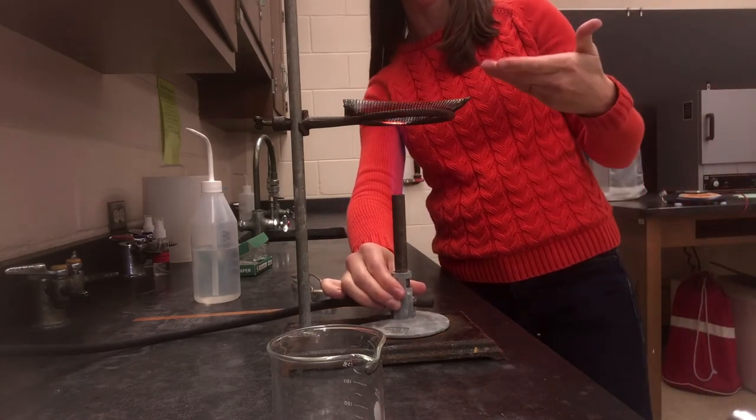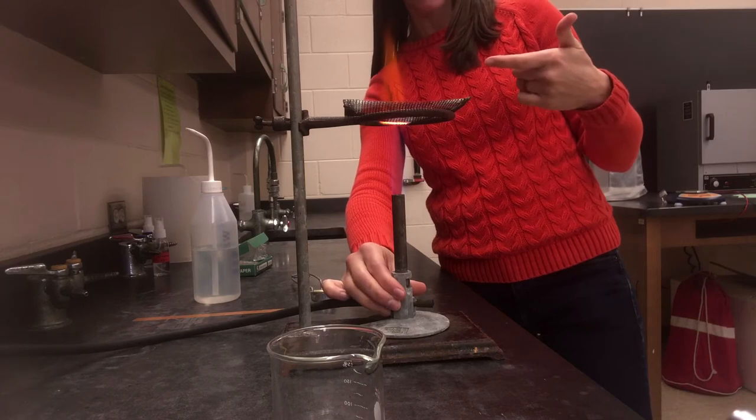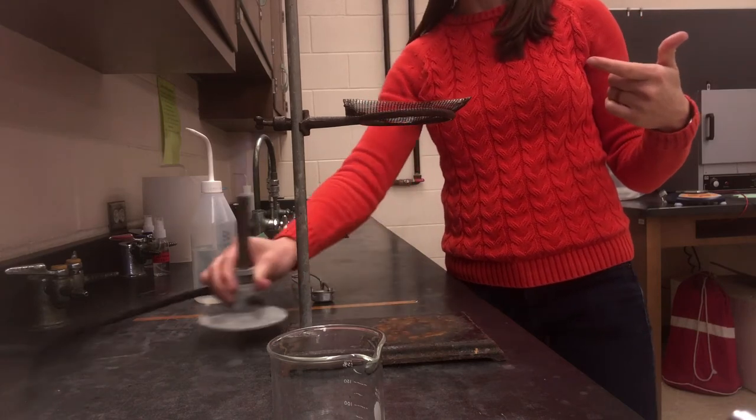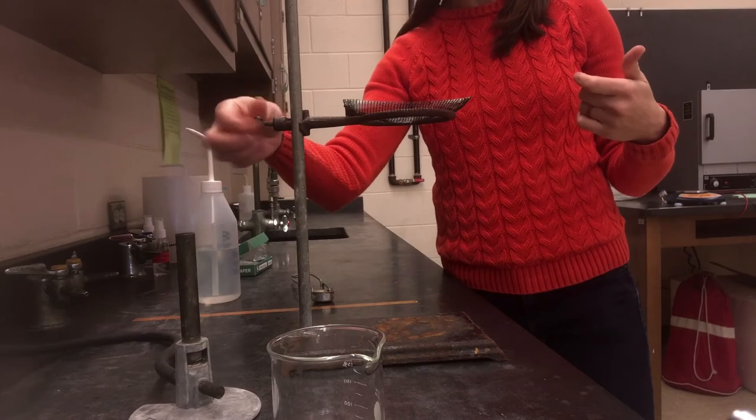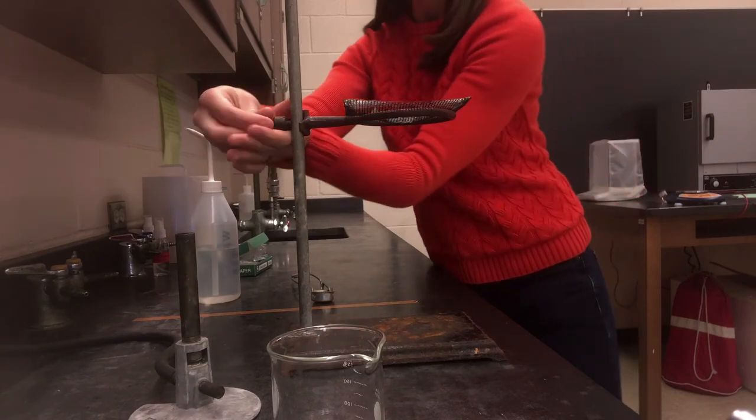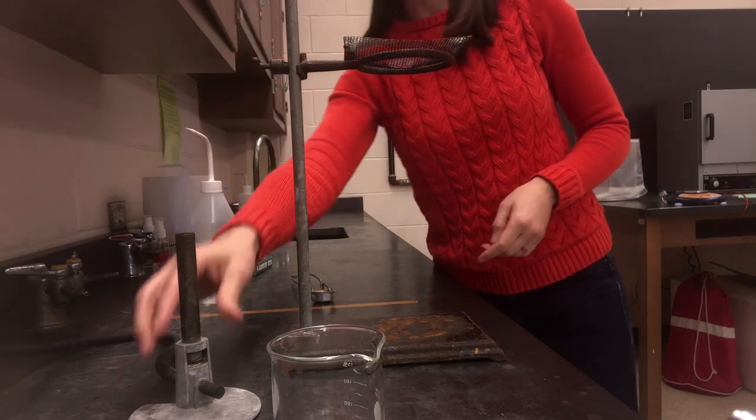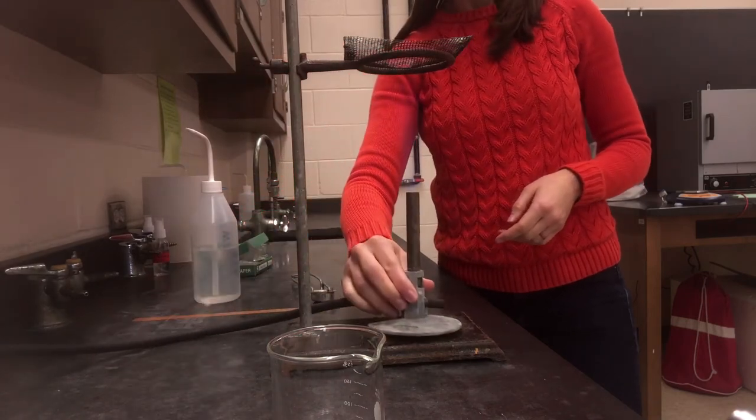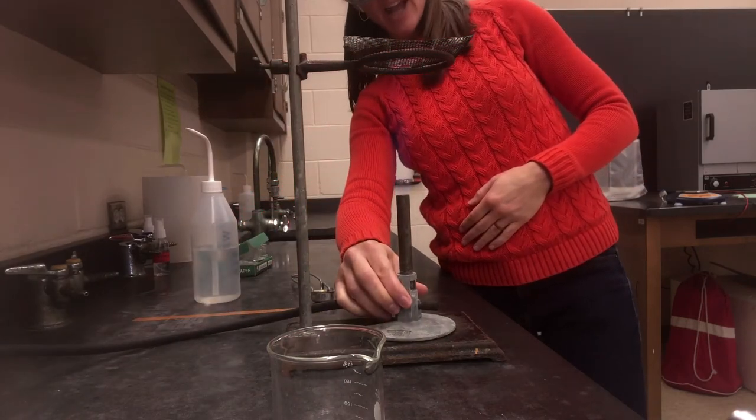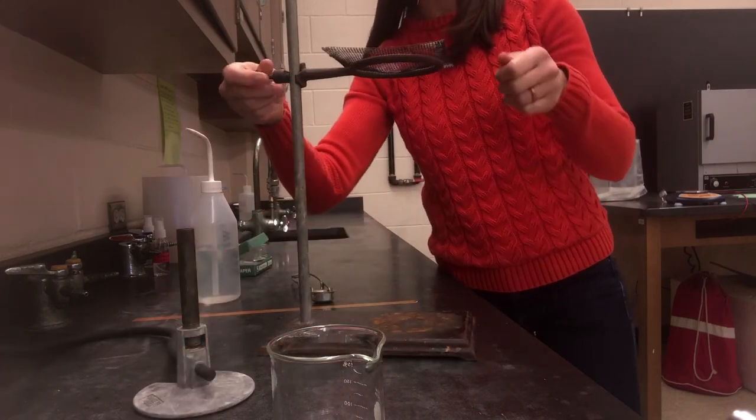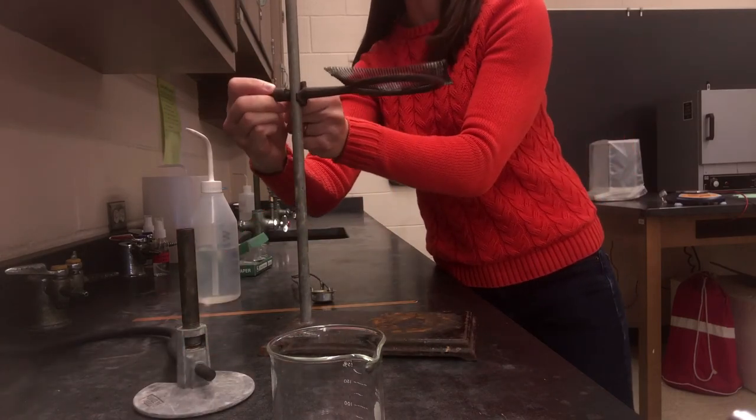So I'm going to move my Bunsen burner out of the way. Since it hasn't been heating at all for any period of time, I can actually raise the ring on the ring stand to adjust. You can tweak it a little bit until you get the height that you want. Do be cautious though—once you start heating, the area of the ring and the metal that was over the flame is going to be hot.